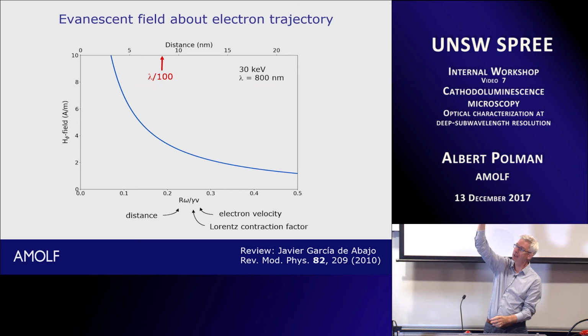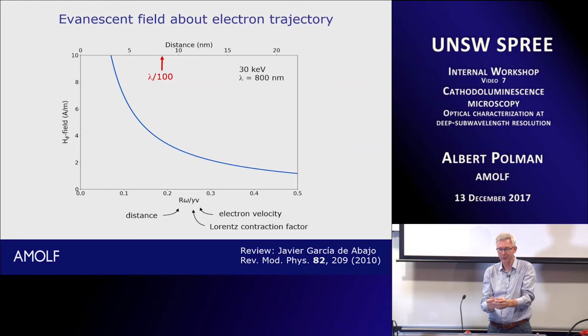That means if I have an electron in an SEM and it hits the surface, the charge distribution of that electron is about 1 nanometer big, right? There's some wiggle in the source, and there's some optics of the electron beam. So altogether, I can focus an electron beam to 1 nanometer in an SEM. But really, we were talking about the electric field that was inducing all these optical transitions. So how big is the electric field?